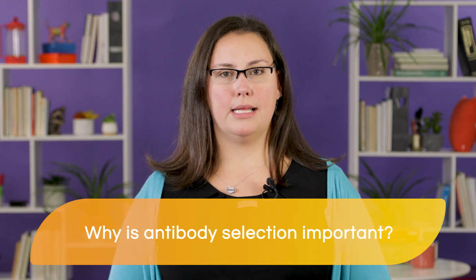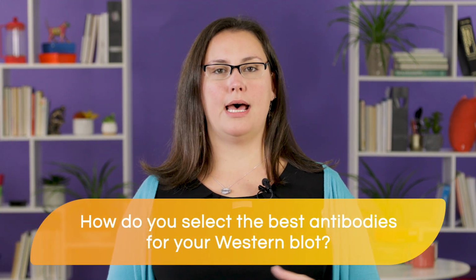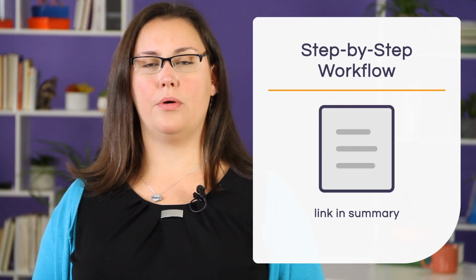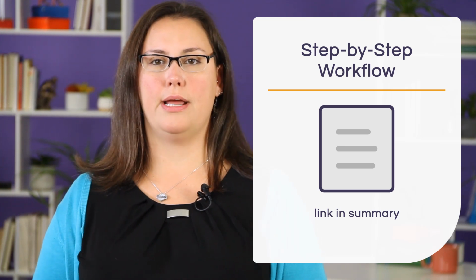All right, so with all of that in mind, we have established two goals for this course. The first one is to discuss why antibody selection is so important for you and your Western blot. The second goal is to walk you through a streamlined process where step by step we discuss how to properly select your primary and your secondary antibody. At the end of the day, we're going to have created a workflow that you can print and follow every single time that you need to select your antibodies for your Western blot protocols.